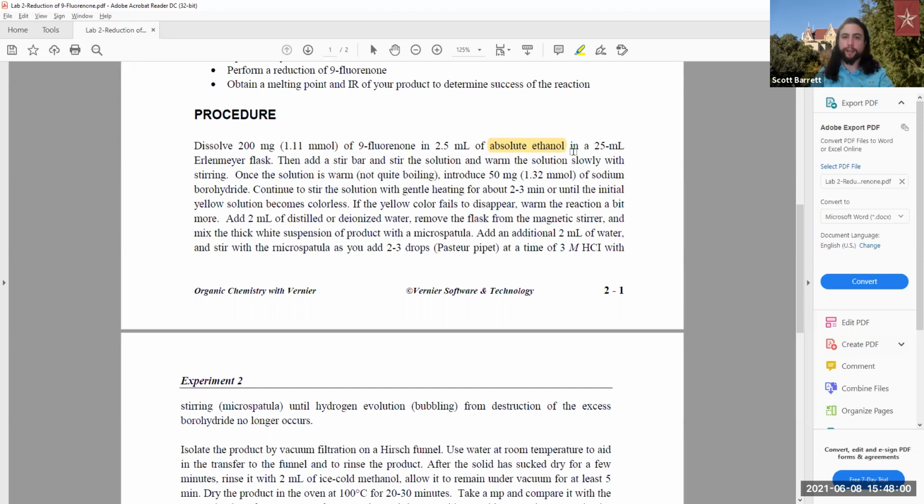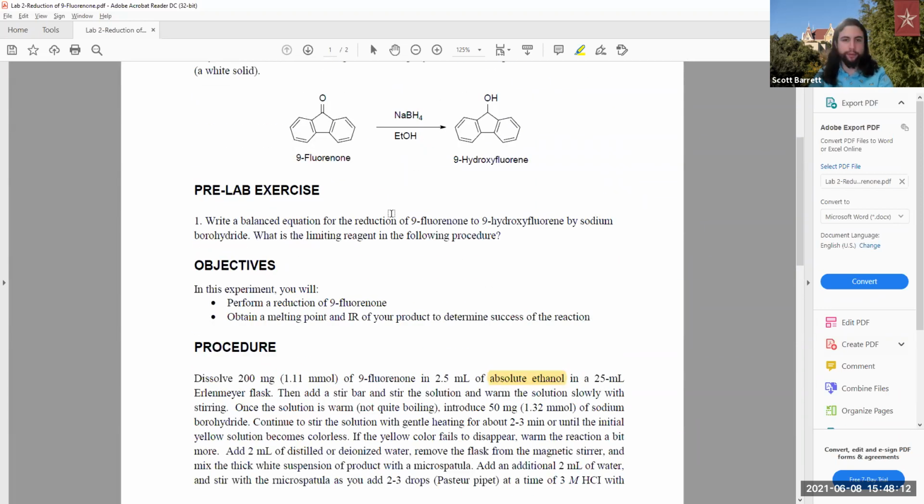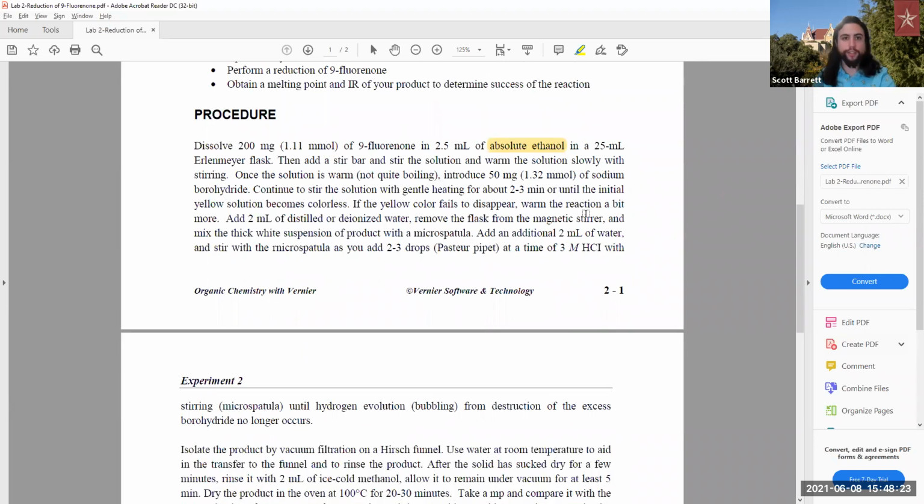Commonly in organic chemistry, we want to reduce the quantity of water in organic reactions because water can be detrimental for certain uses of sodium borohydride, lithium aluminum hydride, any sort of hydrides. They are so reactive that they will pull the hydroxy group from water and neutralize your reagent. Then you would have a low yield, and you don't want a low yield. You want to make sure that most of your starting material goes forward and reacts appropriately.